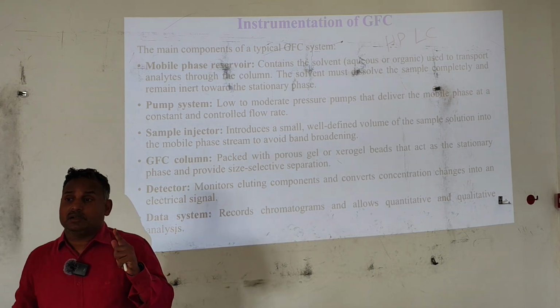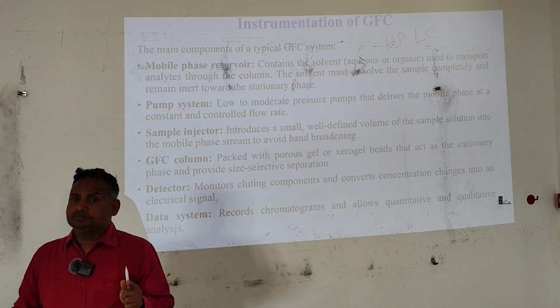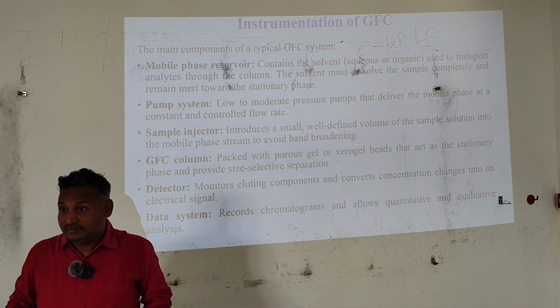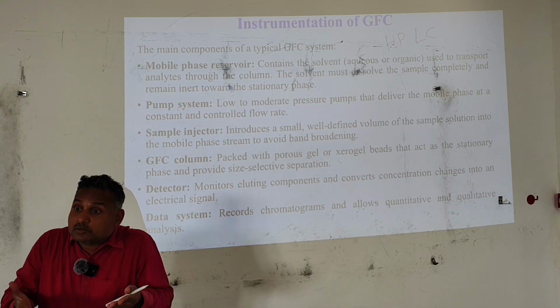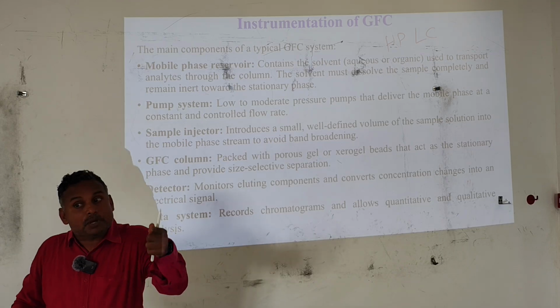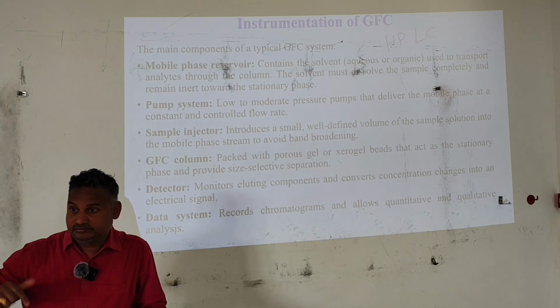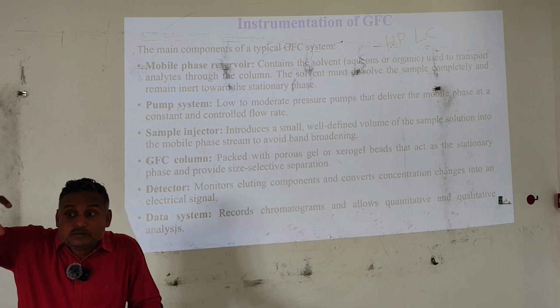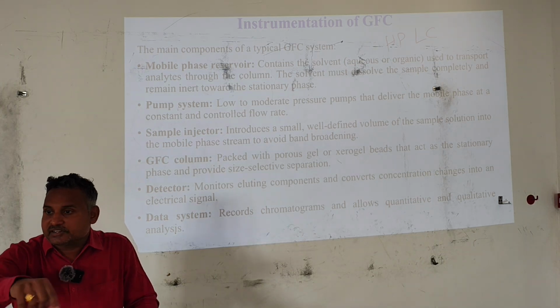Any detector will function on the same phenomenon. What is the phenomenon? Measuring a particular property. It may be refractive index, absorbance, or electrolytic conductivity. Measuring a particular property and then converting the property into an electrical signal. Are you getting it? So the magnitude of that electrical signal depends on the number of molecules, which indicates the concentration.